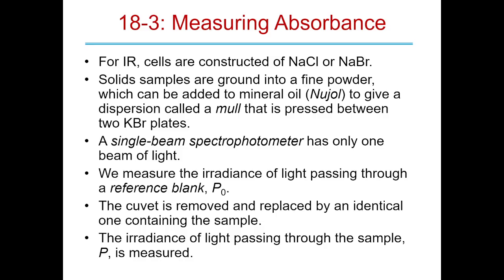And how you actually treat them and get them so they're smooth again, because they do erode over time if you use them. They can, from the moisture in the air, slightly get wavy on the surface because moisture dissolves it and then replates it out as it evaporates. Anyways, they corrode over time.